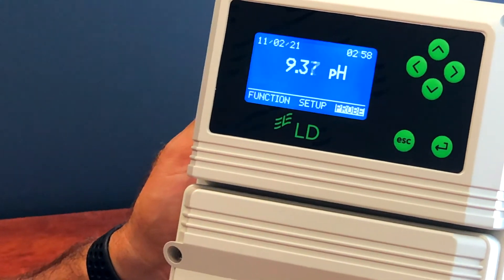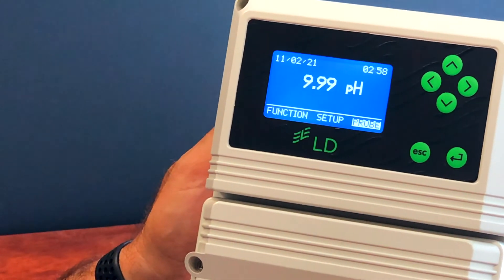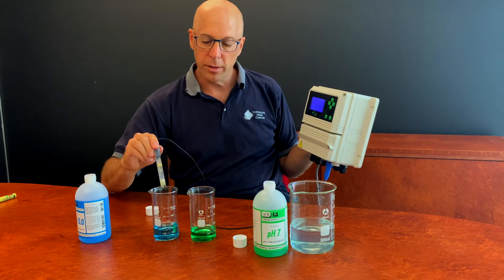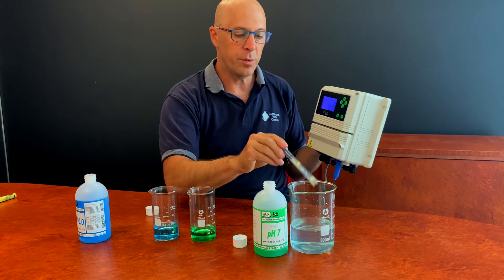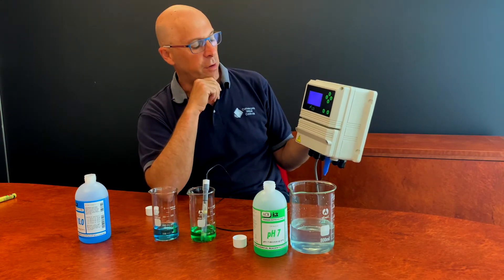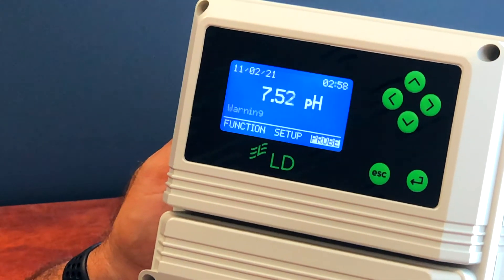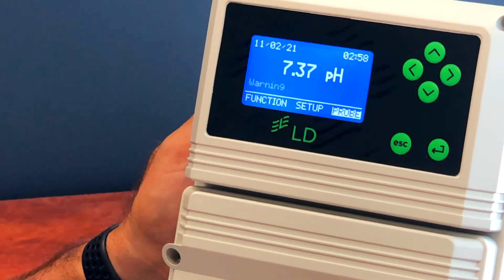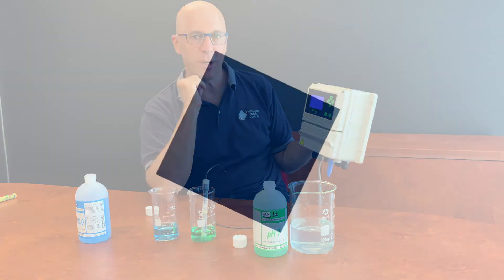Because it's still in the 10 buffer, the reading should go to 10. There we go — as you can see it's close enough to 10. Take the probe out and give it a rinse. I'll pop it back in the 7 buffer and you'll see the reading drop back down to 7. If it does, which it should, that demonstrates that the controller is perfectly in calibration. It'll take a bit of time to get down but it will eventually reach 7.